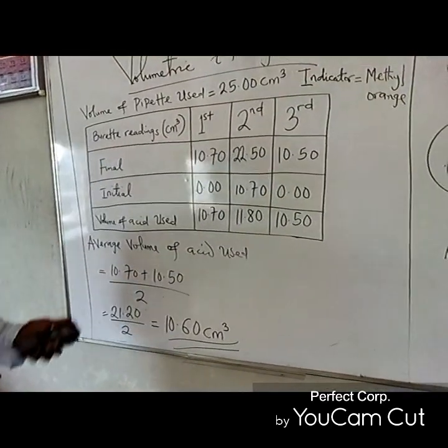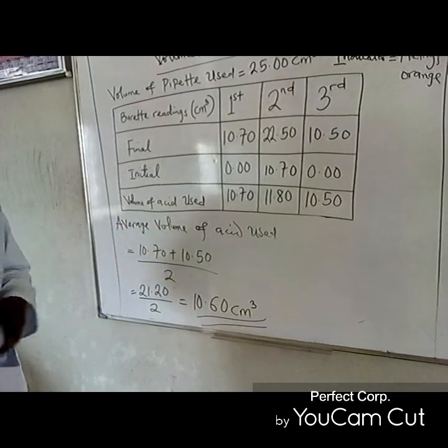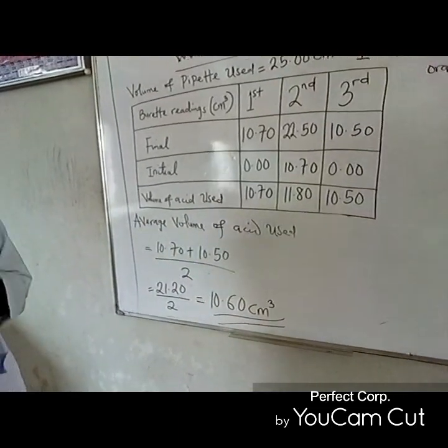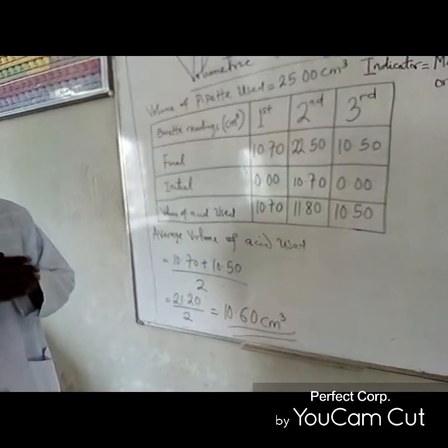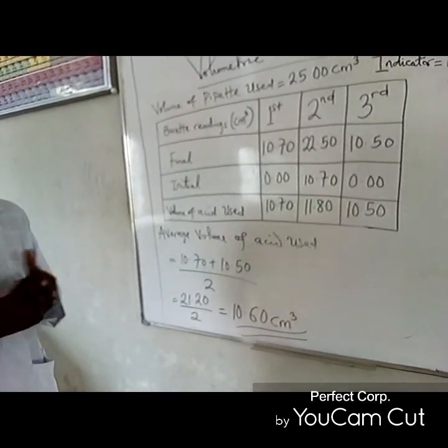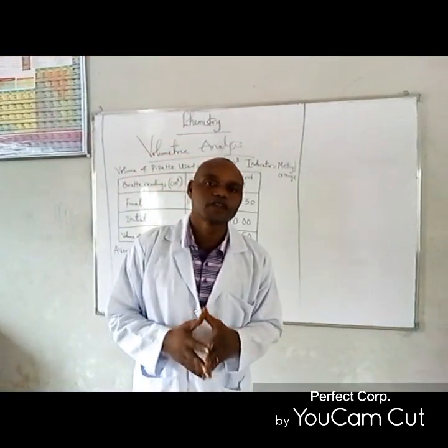So these are just the simple steps that we need to follow when we are carrying out volumetric analysis. When you follow these procedures, obviously you will not have any issue, and hopefully you come out in flying colors. Thank you very much for your time.